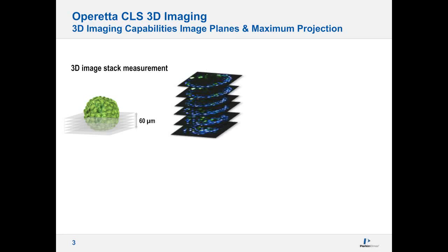As Jacob pointed out, these models are becoming more complex, and the reason for doing this is that we really want to recapitulate the in vivo environment. When we challenge these cell models with compounds or drugs, we're trying to mimic that in vivo environment, and the 3D models really are a good way to do this in an in vitro plate.